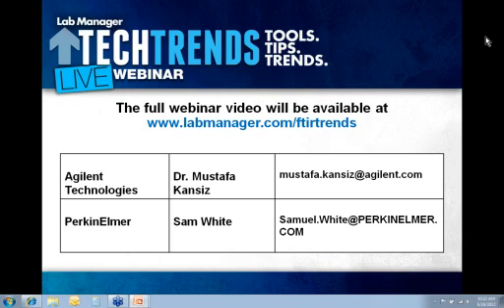What about applications that involve the combined Raman FTIR for microanalysis, particularly in areas like forensic, pharmaceuticals, and biomedical fields? Have either of you had experience with the combined Raman FTIR? I have.